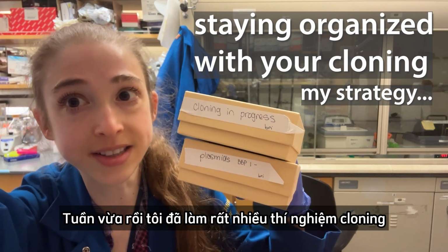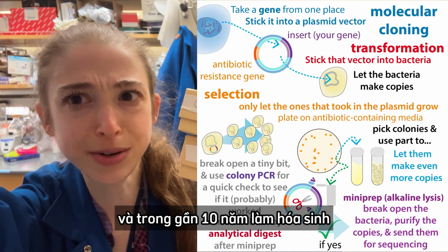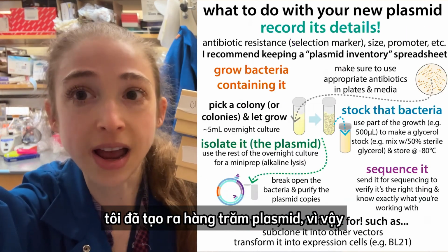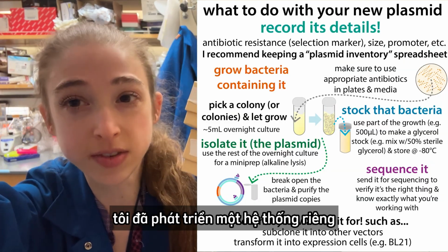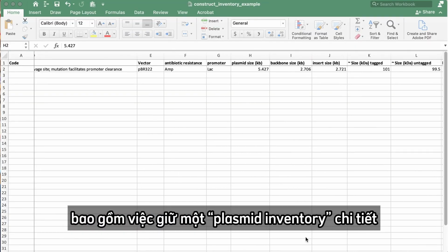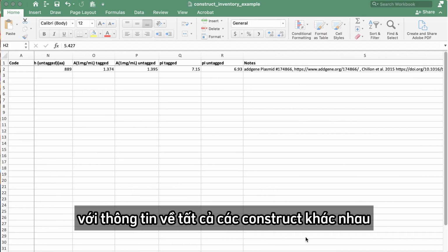A lot of cloning in this last week or so, and over the course of my nearly 10 years in biochemistry, I've made nearly hundreds of plasmids. In order to keep track of them all, I've developed this sort of system, and I thought I'd just share with you what works for me. This includes things like keeping a detailed plasmid inventory with information about all the different constructs.